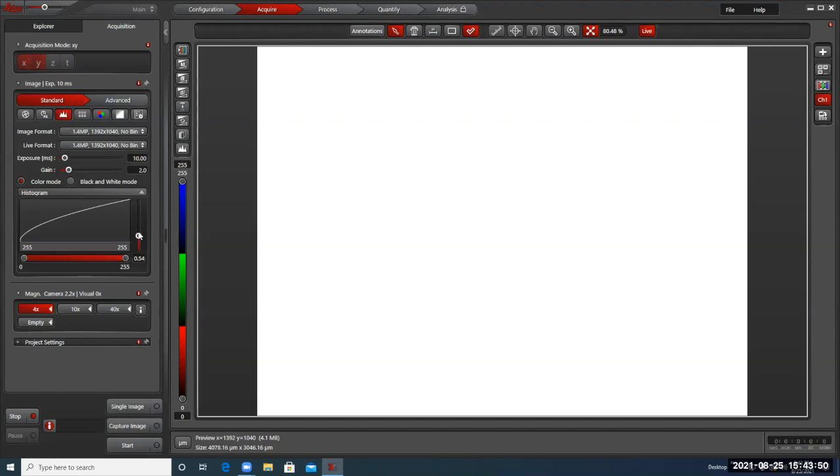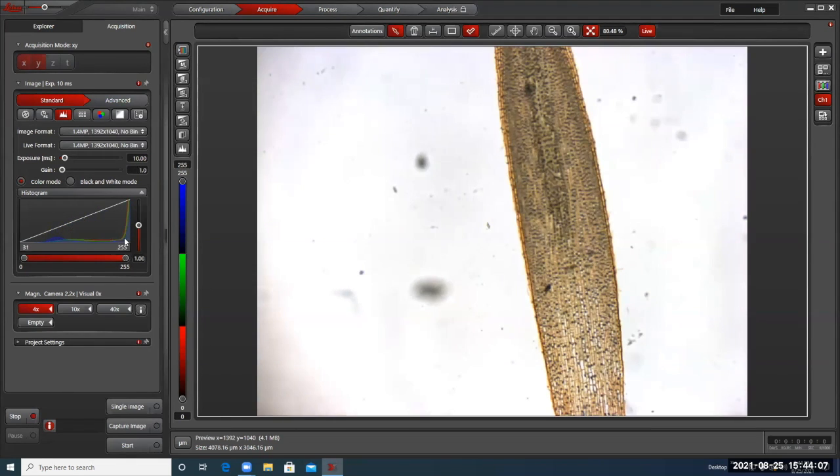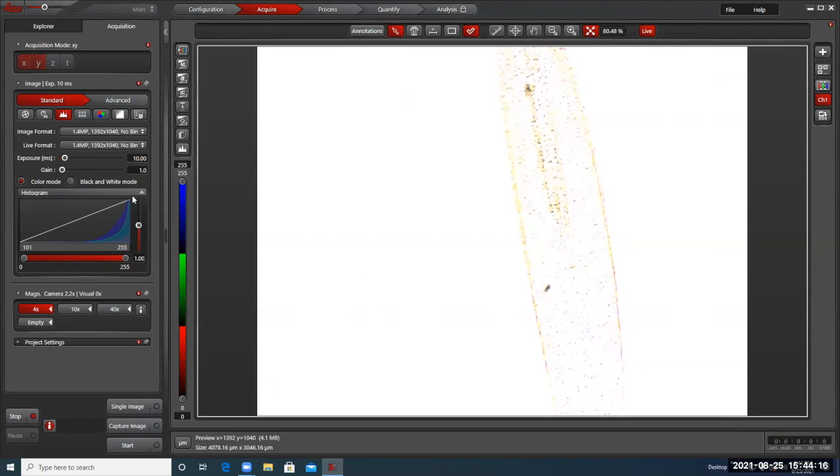And you can also just type that in, make that go back to 1, make my gain go back to 1. And wow, it is still too bright. Okay, well, I can see it knows something's there. I'm going to just turn down my, there we go. I'm turning down the bright field lamp. And the lamp's a little jumpy. You see how this is jumping around? It's sort of annoying. So you sort of want the lamp up a little higher.